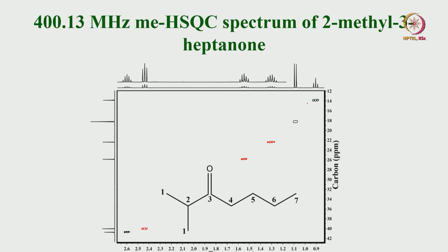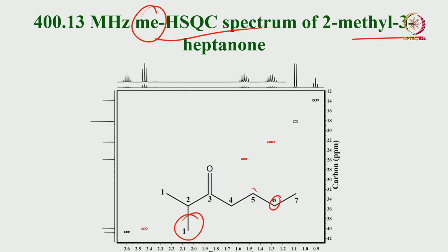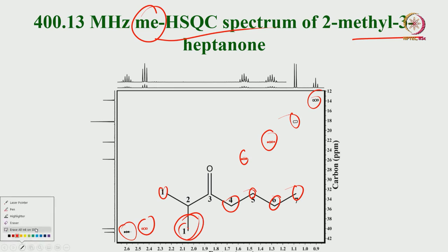For 2-methyl-3-heptanone at 400.13 MHz multiplicity-edited HSQC: an extra methyl group is added compared to the previous molecule. Now there are 3 CH2 groups (negative/red) and 3 CH3 groups (positive). The CO carbon gives no signal. This confirms how easily CH2 and CH3 carbons are identified based on sign in the multiplicity-edited spectrum.